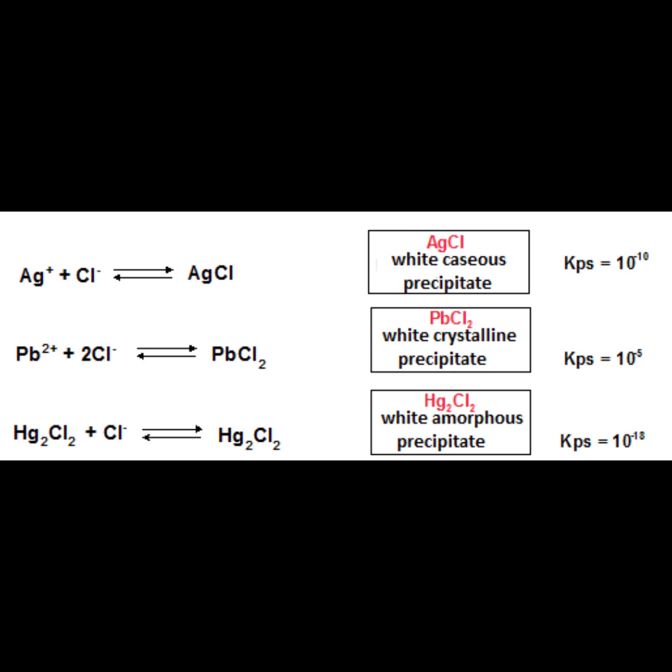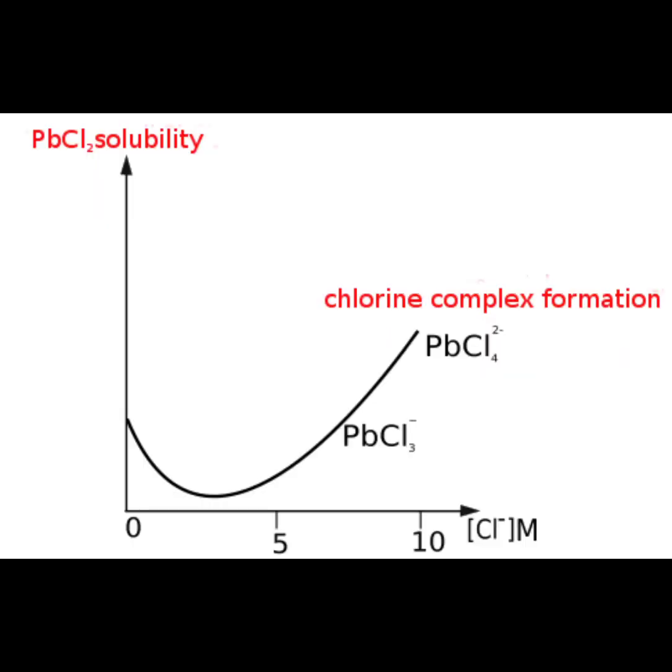This is because concentrated hydrochloric acid promotes the formation of soluble chloride complexes of our salts. As you can see from the scheme, as the concentration of the chloride rises, the soluble complexes formation rate grows. These complexes are soluble because they are electrically charged molecules and therefore efficiently solvated by water molecules through thermodynamically advantageous ion-dipole interactions.